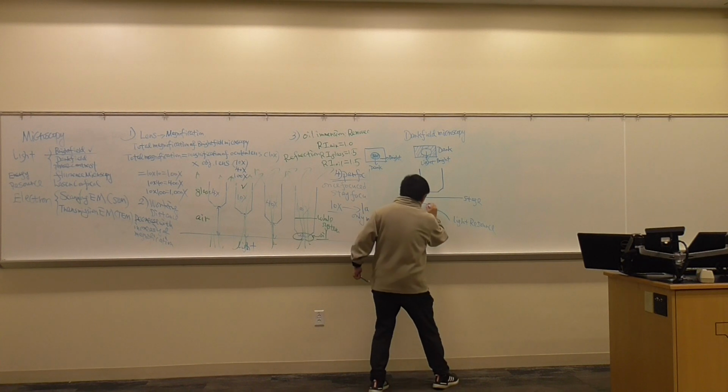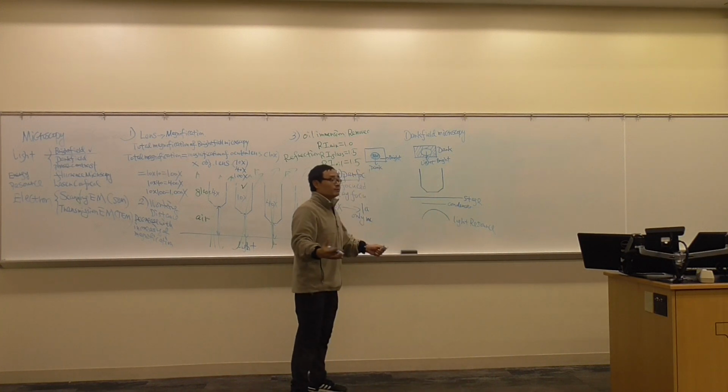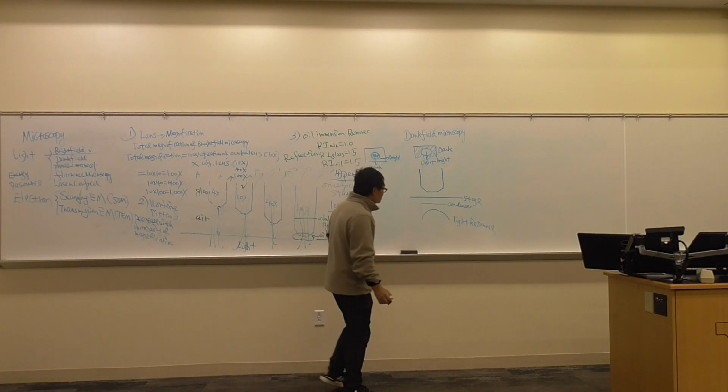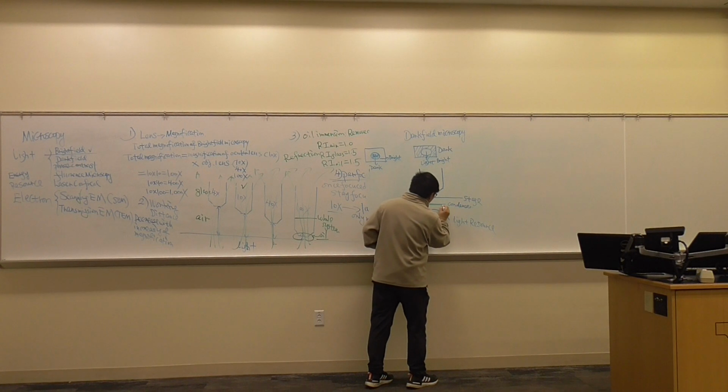And I have a condenser here. What's the special structure? Underneath the condenser, we put a very solid block.